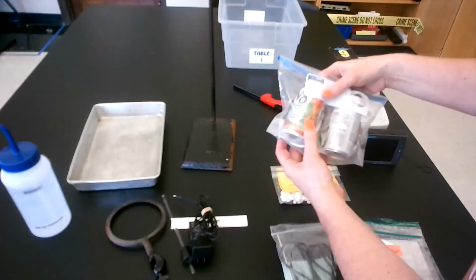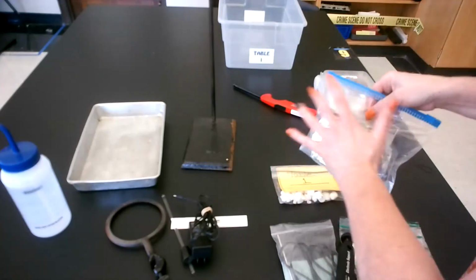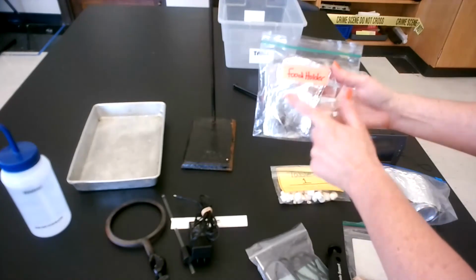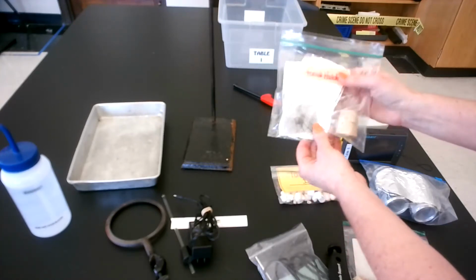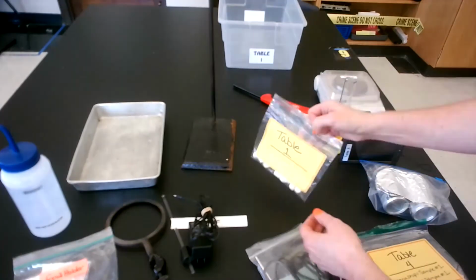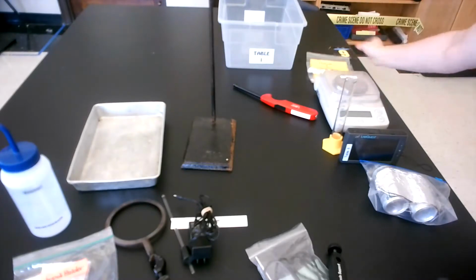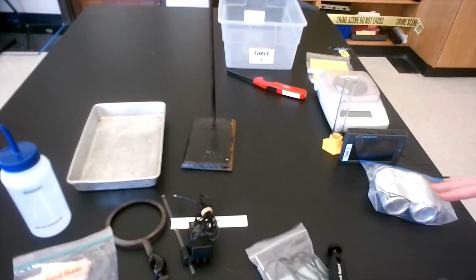We have 2 small cans. These are like 5.5 to 6 ounce foil cans. Don't worry about the Ziploc bag. We're going to construct a food holder that is a cork, foil, and then in here we also have 2 pieces of screen with a paper clip, and I'll show you how we're going to build that in a second, but there's 2 of those. And then our food samples. You'll only have one of these bags. I pulled both. It just depends on what table you're sitting at, so I'll explain that in just a moment. And then the last thing would be a lighter to burn our food. One thing we do need to make sure of is no loose clothing, hair pulled back, and all of our safety protection on, and we will be wearing gloves for this lab.